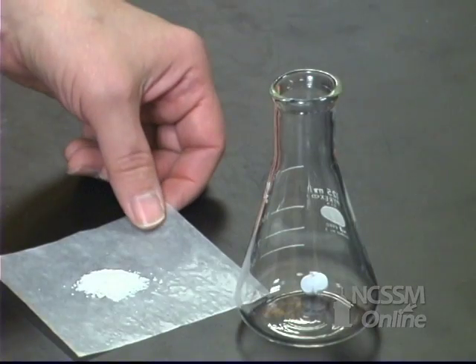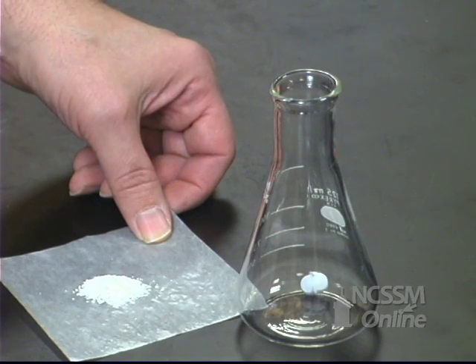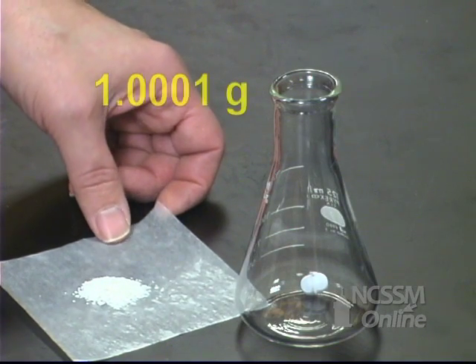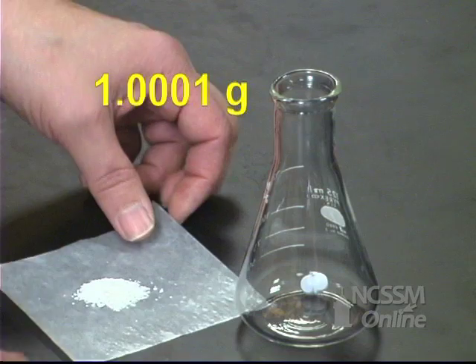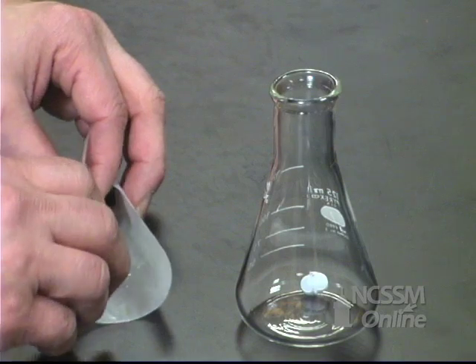We're going to analyze a sample of eggshells for the percent calcium carbonate in the eggshells using a back titration technique. We've massed about 1 gram of dried powdered eggshell. We're going to add that to a 125 milliliter Erlenmeyer flask.